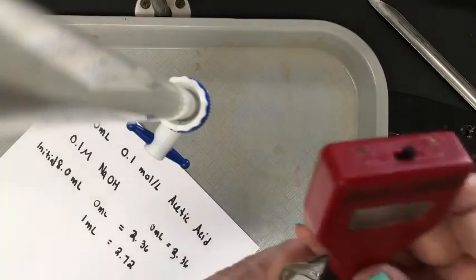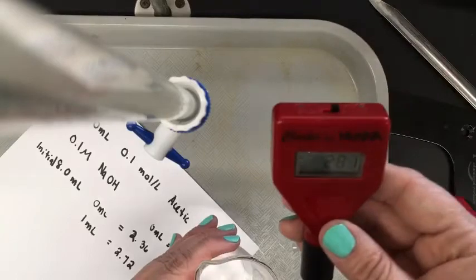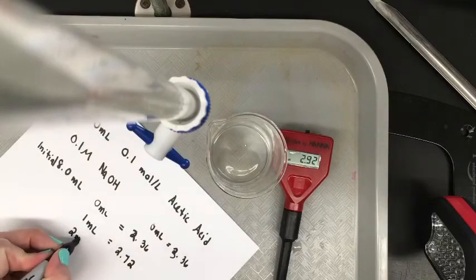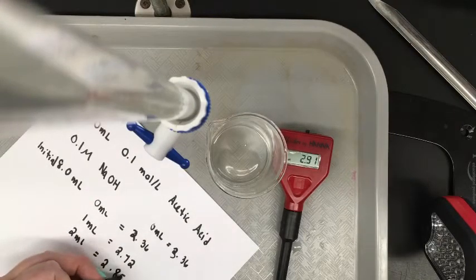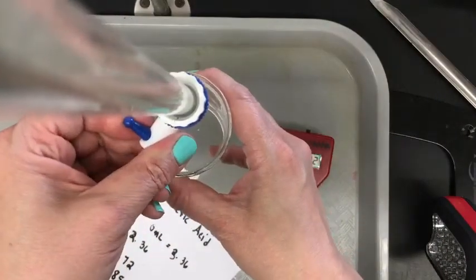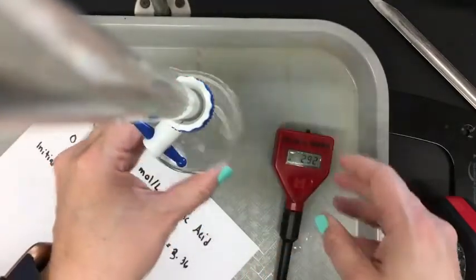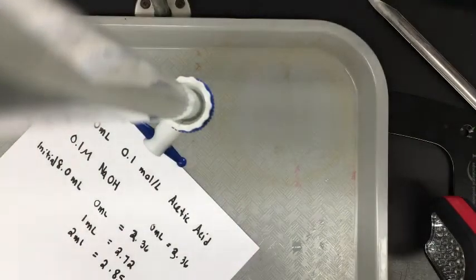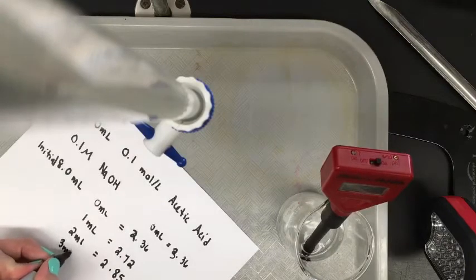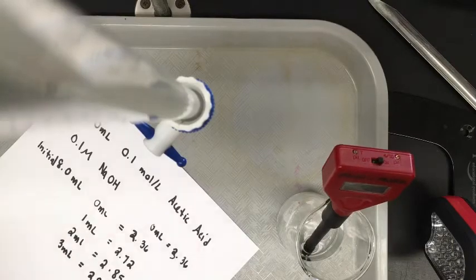Now we're stabilizing at 2.85. It fluctuates once I take it out. 2.85. We'll add another milliliter very carefully. There's my third milliliter. Do a swirl, take a reading. 2.97. So at 3 milliliters of base added, actually, it stabilized at 2.98.